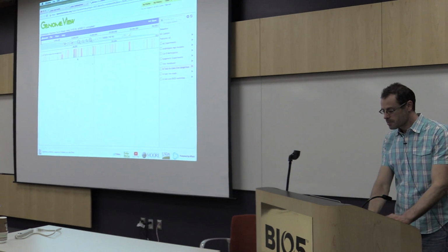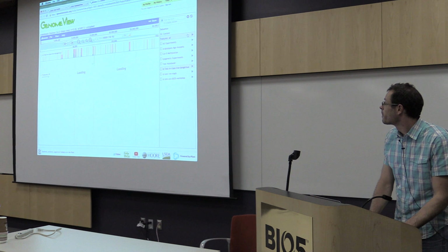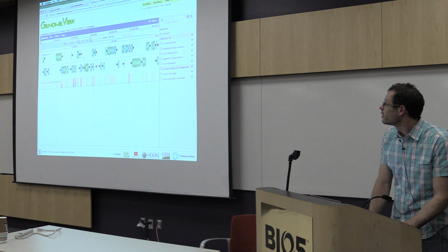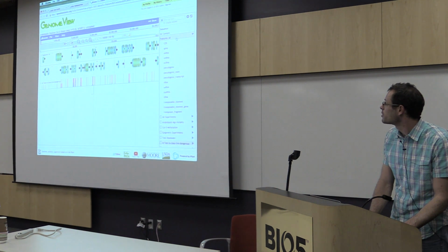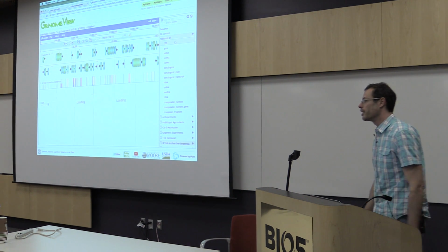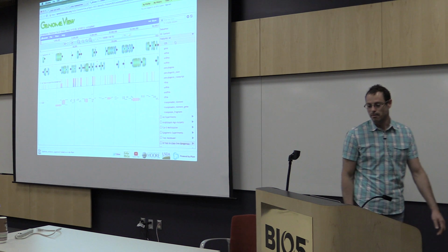So here's those experiments. I'm going to go ahead and turn on the features. And so this will generate for us our track. This is using CoGe's way of visualizing genomic features with the dashed line separating your top strand and your bottom strand, and these overlaid arrows representing different parts of a gene. If you like the traditional GBrowse way of doing it, of just boring, flat, unexciting arrows, you can do that too. We like our 3-dimensional tubes much, much, much more.